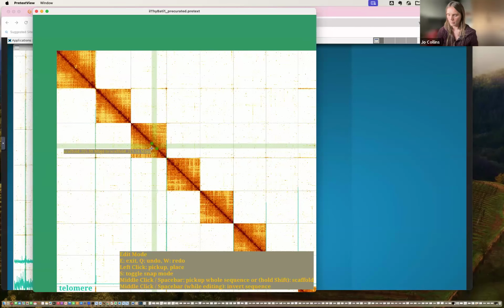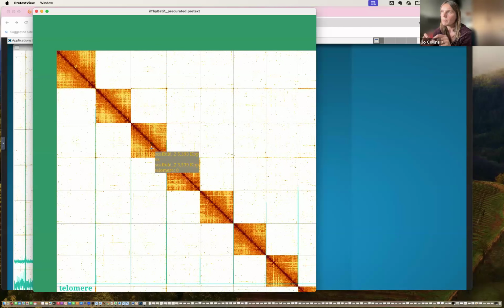So the reason that we want to do that is we want to do most of our editing with snap mode on, because it's very easy otherwise to insert or to make small pieces accidentally. And this can upset the upstream process when you're making your TPFs, because the scripts can see small pieces that you haven't made by design, you've just done accidental things, and that can confuse the script. So that's not ideal.